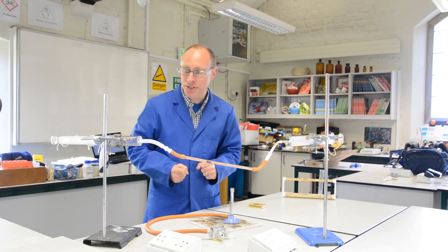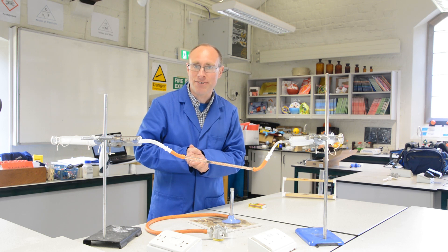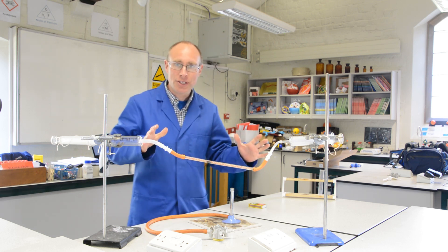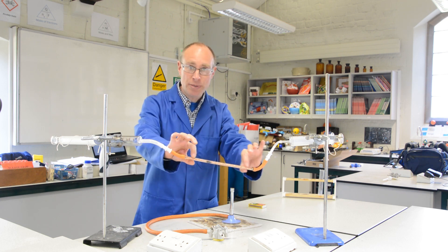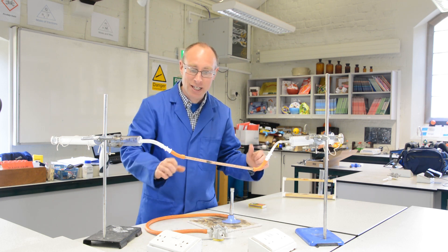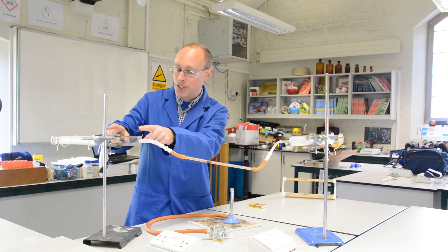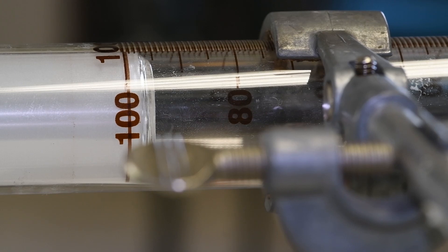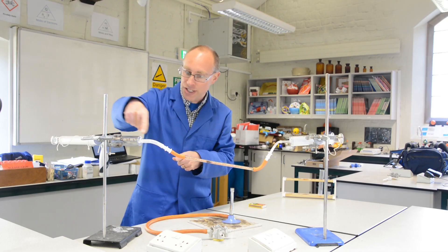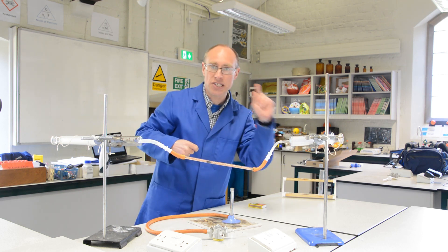In this experiment I'm going to try to show the amount of oxygen that there is in air. If you look at the equipment, what we've got is a tube here which contains copper — hopefully you can see the orangey colour of that copper. We've got a gas syringe here where there is 100 centimetres cubed of air, and that gas syringe is connected through the tube to another gas syringe which is currently reading zero.